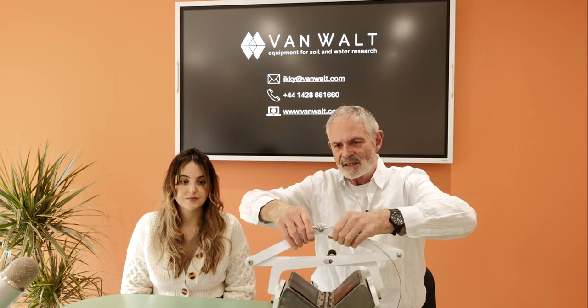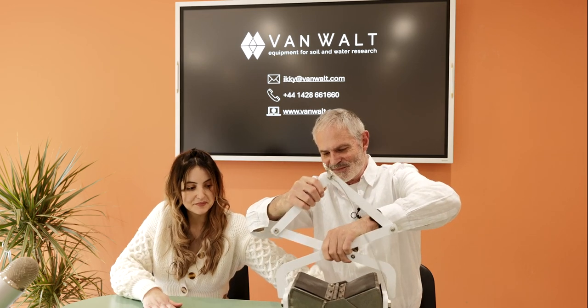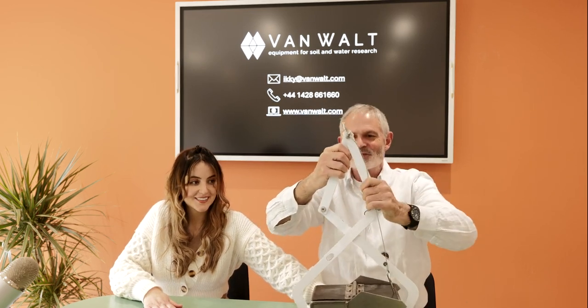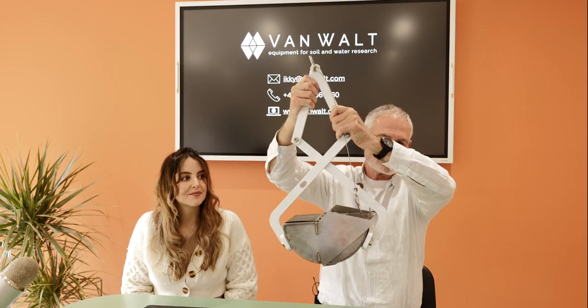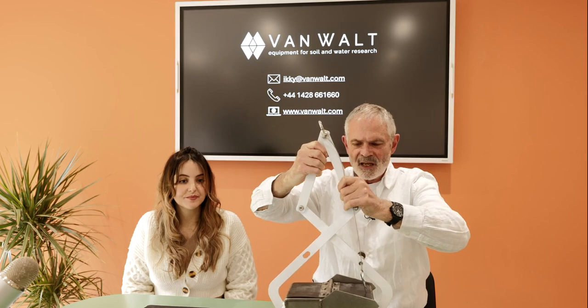As it comes to the base, automatically the jaws are triggered, and I'm trying to not take the table with me. The jaws close and the sample is contained within the sampler itself.